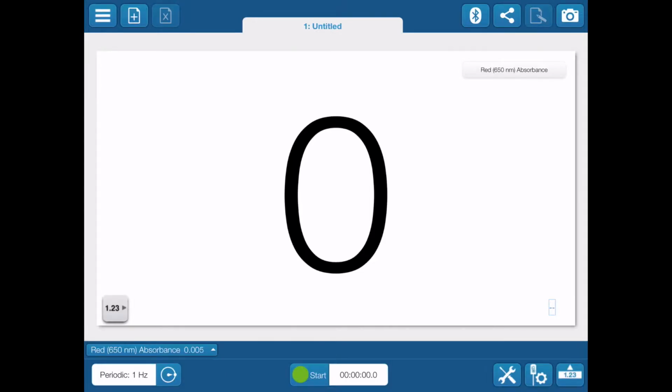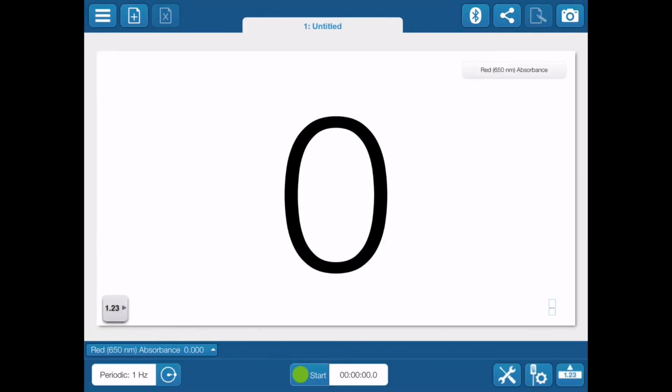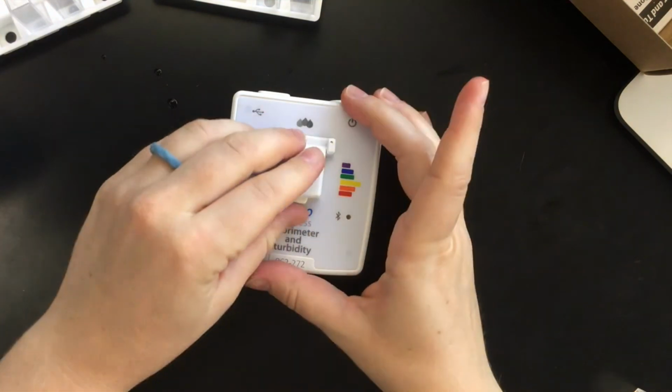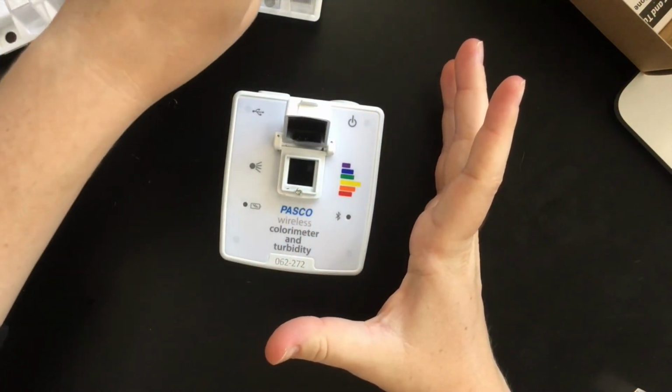Once you have your distilled water in the colorimeter, you'll want to calibrate. In order to do that, in the lower left-hand corner it says red 650 absorbance. Click on that, and then you'll say Calibrate Sensor. It'll select a wireless colorimeter for you, and the measurement will be selected, and then you've inserted it, and all you do is press Calibrate. And then you'll get a green arrow and you'll click Done. After you've calibrated, you can take it out. You can leave the distilled water in it for the next group.